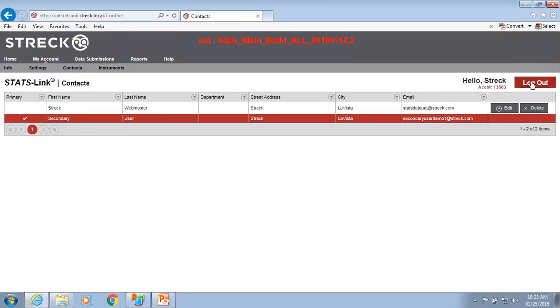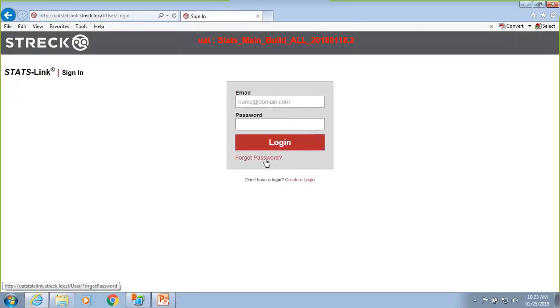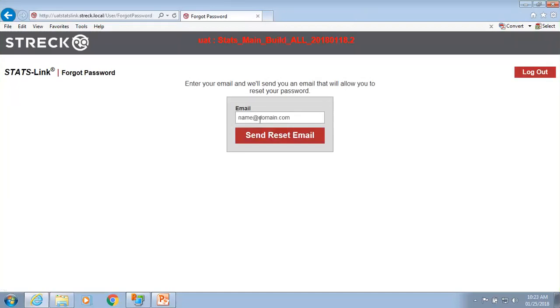At this point, we'll go ahead and log out with this particular user, and I'm going to use the forgot password function. So I'm going to click on forgot password and enter my email address.